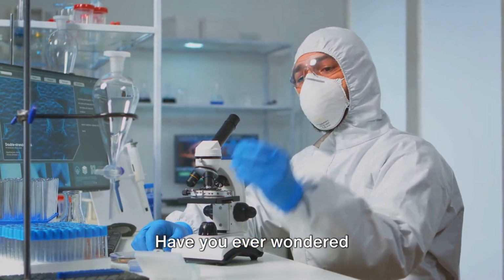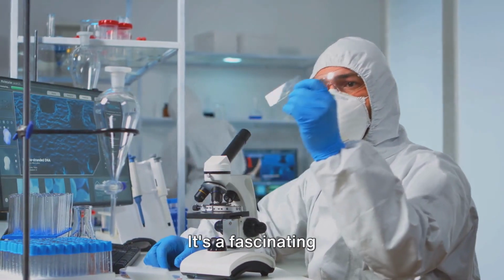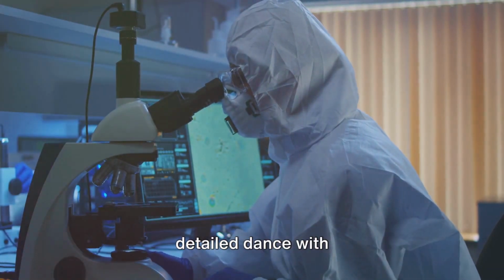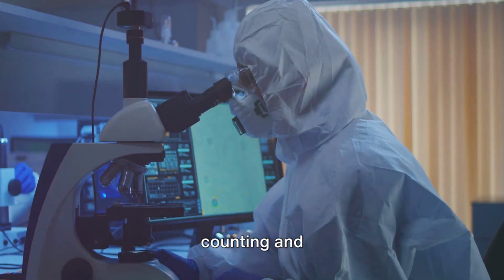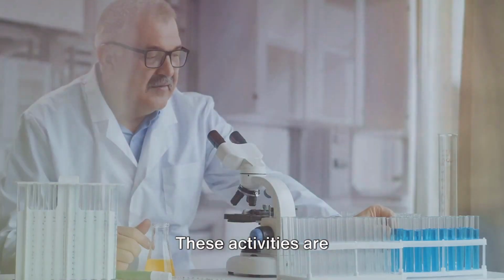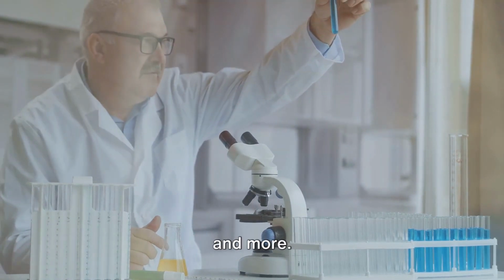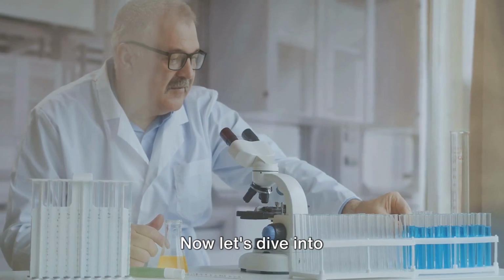Have you ever wondered how scientists ensure food and feed safety in a microbiology lab? It's a fascinating world where the smallest organisms play a huge role. Ensuring food and feed safety involves a detailed dance with microbiology, where sterilization, media preparation, bacterial counting, and identification techniques take center stage. These activities are vital in identifying and controlling potential threats like food spoilage bacteria, food poisoning bacteria, and more. It's a complex process, but don't worry, we'll break it down.